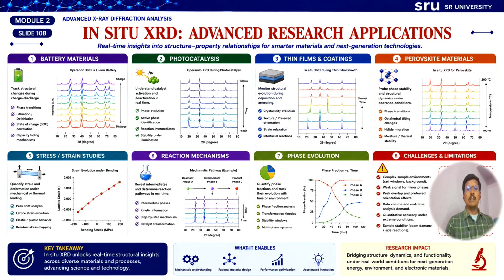Coming to the phase evolution, you can see the phase evolution diagram here. As reaction conditions change, different phases form and evolve with time. Tracking those diffraction patterns and the transformation helps the optimization of synthesis conditions and improves the material performance.